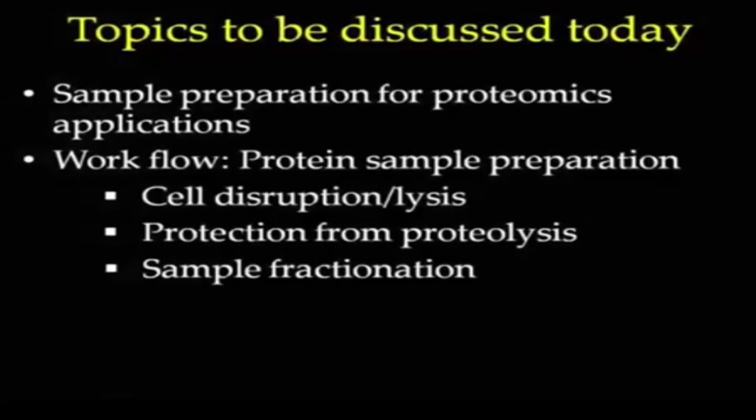An ideal sample preparation will ensure that you have all the protein present in your sample without different types of contaminants such as nucleic acids, salts and other interfering components. In today's lecture, we will talk about sample preparation for proteomics application.